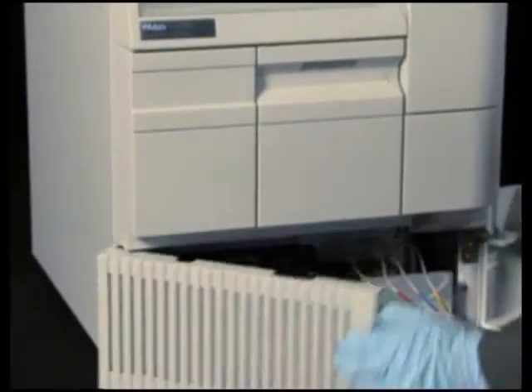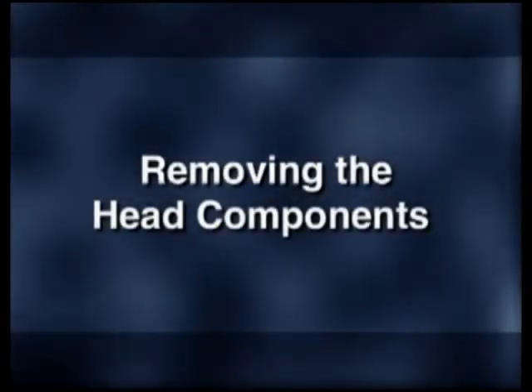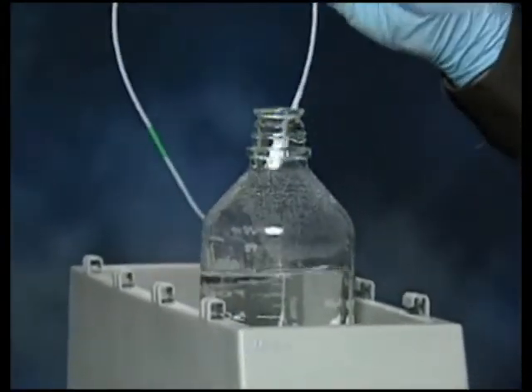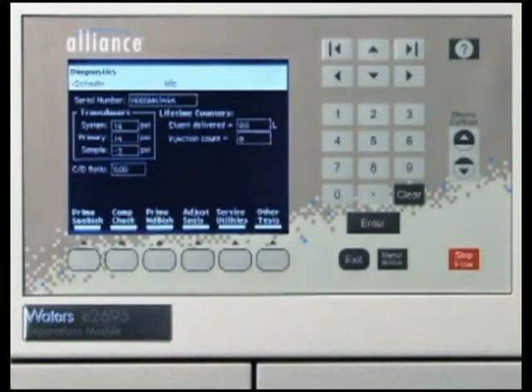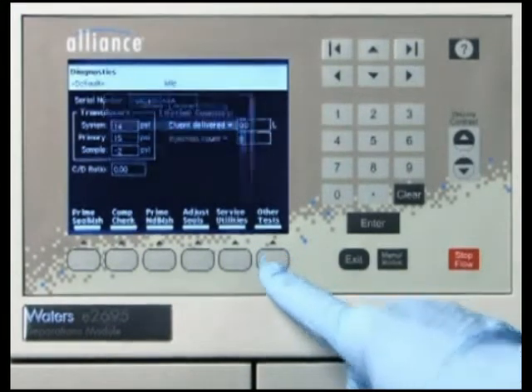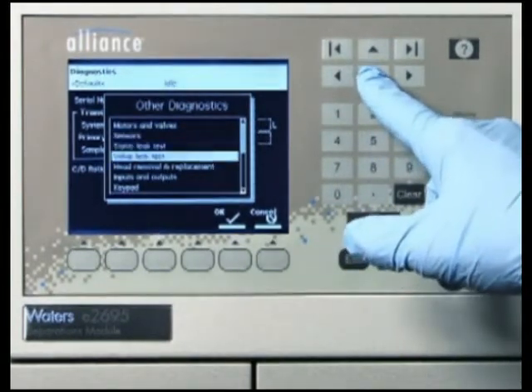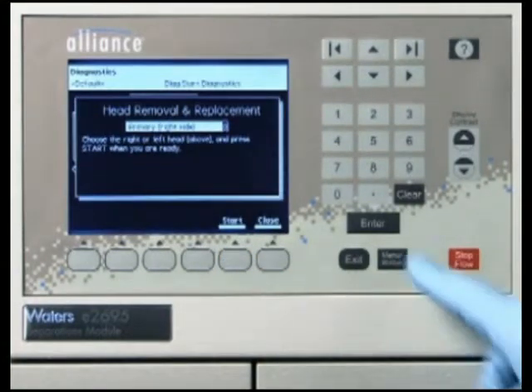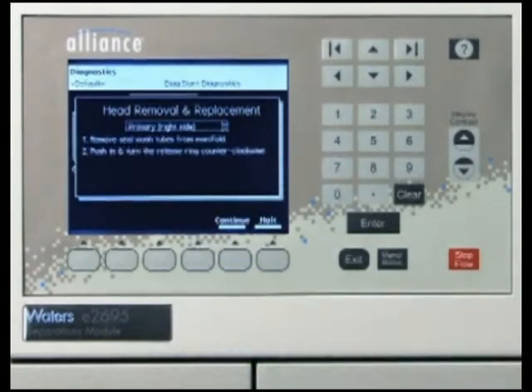Open the solvent management compartment doors. First, remove the plunger seal wash line from the solvent reservoir. From the 2695 main screen, press the Diagnostics screen key, then press the Other Tests screen key. Select Head Removal and Replacement and press OK. Press Enter to display the head choices and select the head you want to rebuild. Press the Start screen key and the screen displays instructions on how to remove the head components.